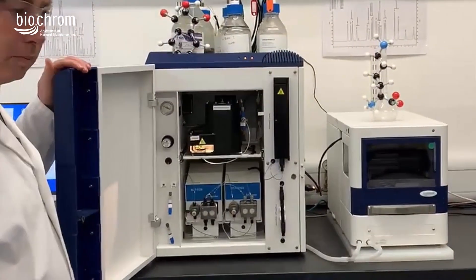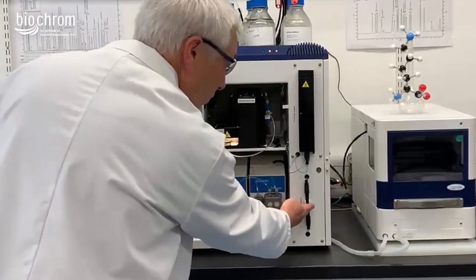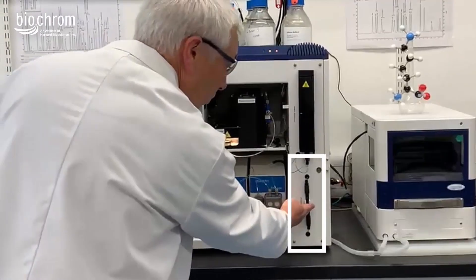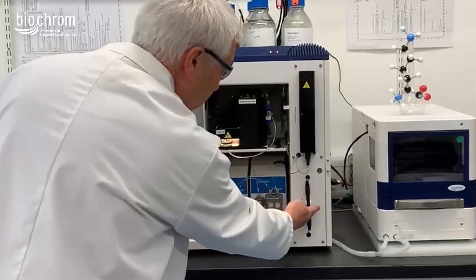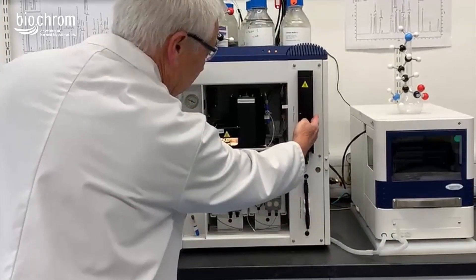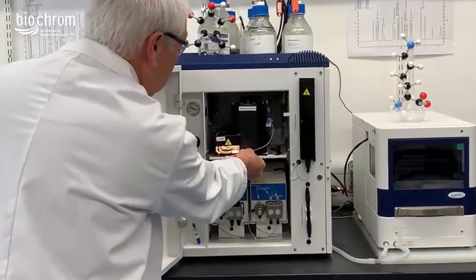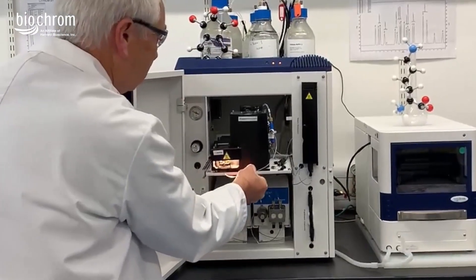Moving over to the large box, you can see that the door just opens straight up on a hinge. First of all, we're going to point out the pre-wash column — that helps clear up any residual material in the samples that didn't get removed through the preparation process. The analytical column is where the amino acids get separated, and that one's actually in an oven, so it is temperature controlled.